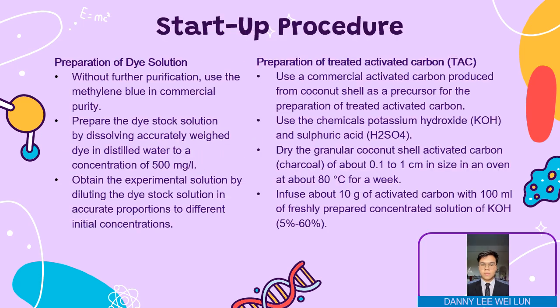as the adsorbate. For the startup procedure, we start with the preparation of dye solution. Without further purification, use the methylene blue in commercial purity. Next, prepare the dye stock solution by dissolving accurately weighed dye in distilled water to a concentration of 500 mg per liter. Obtain the experimental solutions by diluting the dye stock solution in accurate proportions to different initial concentrations.